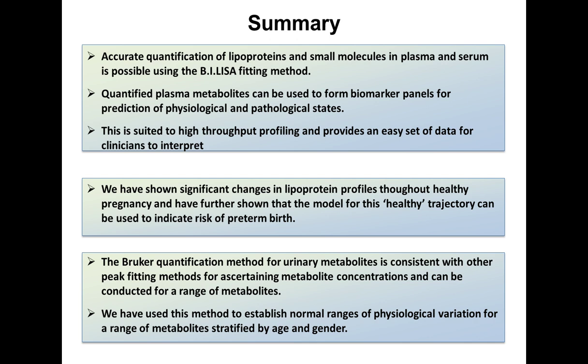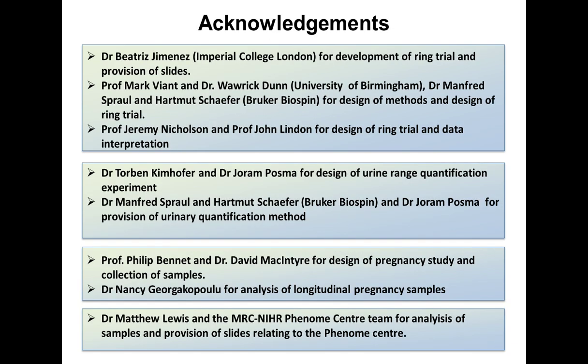I showed you a couple of examples, one in healthy pregnancy, showing you the vast change in lipoproteins and how we can use this to model healthy pregnancy and to predict unhealthy pregnancy or adverse outcomes in pregnancy. Similarly for urine, the Bruker quantification is consistent with other peak fitting methods, and we've now ascertained a range of metabolite concentrations which we're now using and employing in various disease-based studies.